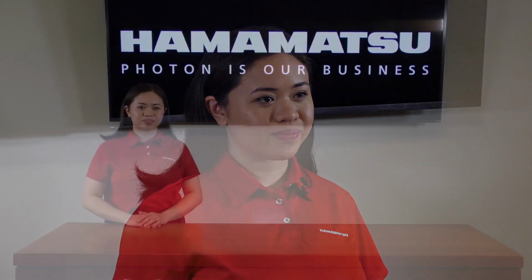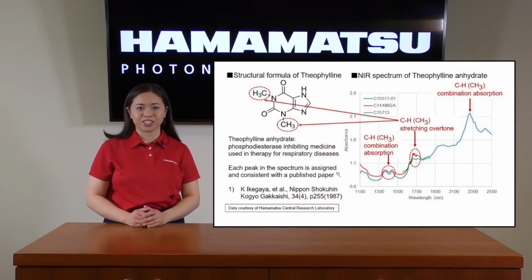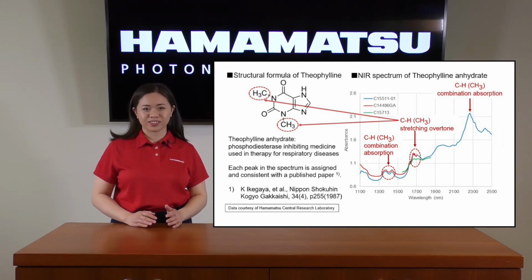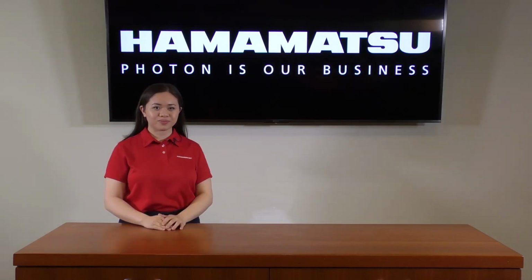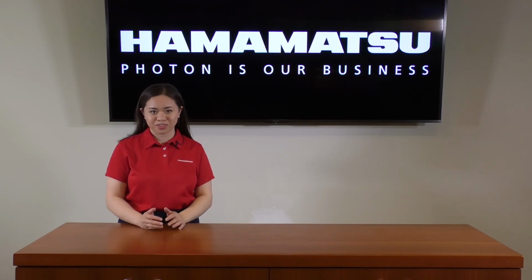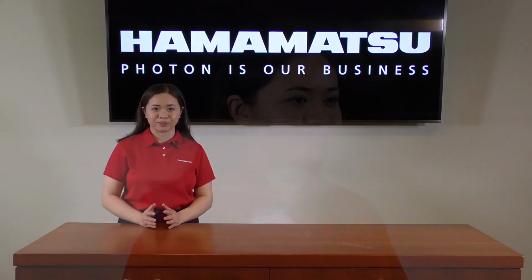Here we have assembled tests comparing some of our NIR spectrometers for pharmaceutical studies. These spectrometers can be used to measure the spectrum reflected from a sample of theophylline, which has key peaks at 1664 nanometers. In these tests, we'll study the differences in spectra for theophylline samples at different concentrations. For these tests, we've utilized 3 of Hamamatsu's NIR spectrometer options: the FT-NIR engine, one of our MEMS-FPI modules, and our thin flat Mini-Spectrometer. Each of these tested with the same light source, sample holder, and optical fiber.